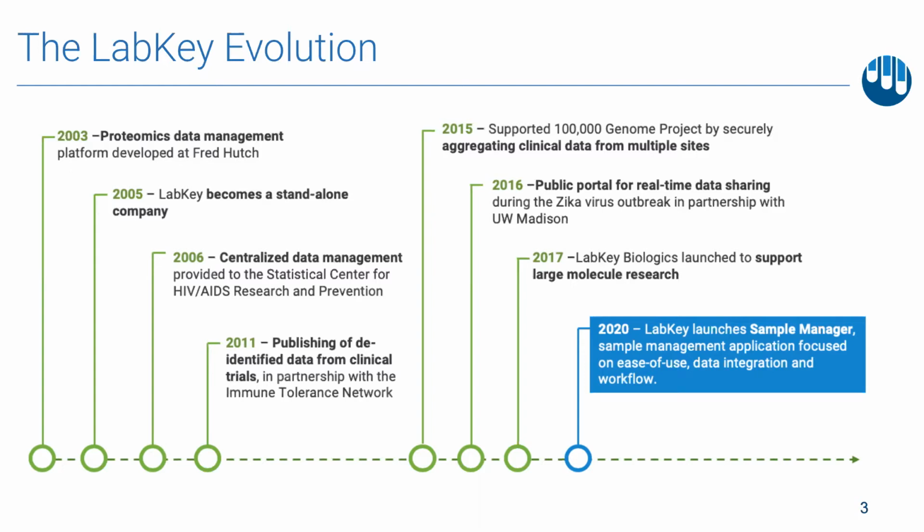In 2015, we were contracted to expand functionality for the 100,000 Genomes Project to aggregate and secure clinical data gathered from multiple sites in the UK. In partnership with the O'Connor Lab at the University of Wisconsin, we began hosting a public portal for real-time data sharing during the Zika virus outbreak to improve data accessibility.